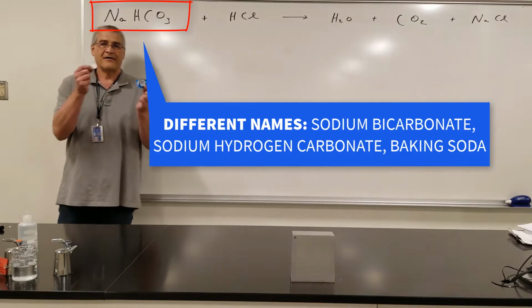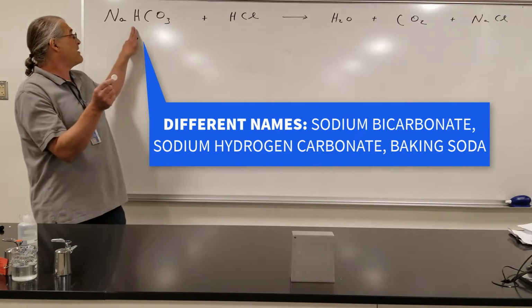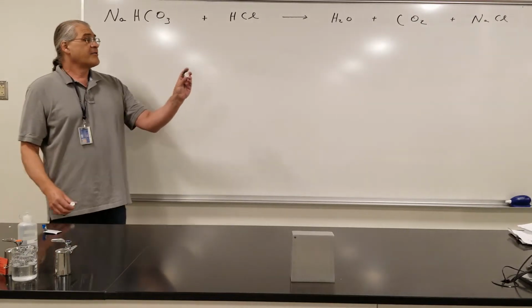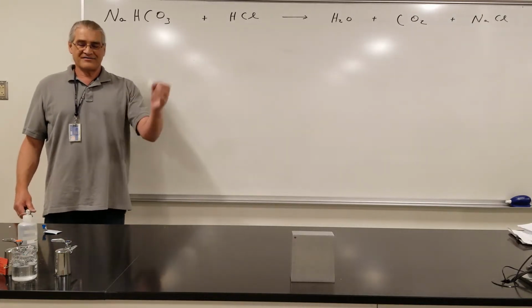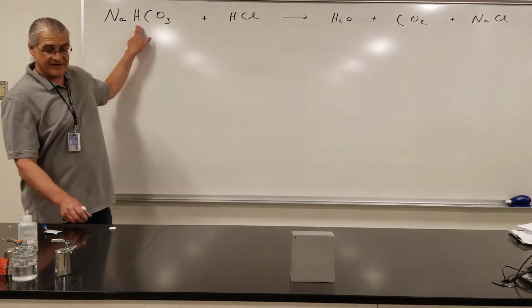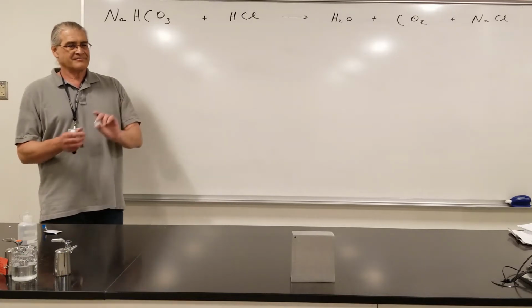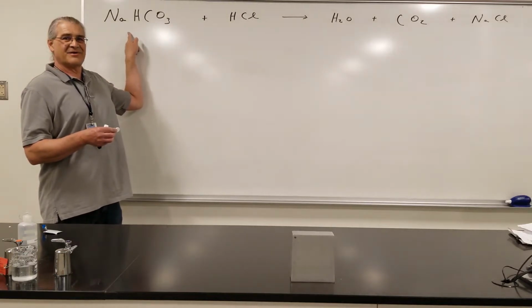Alright guys, our Alka Seltzer tablet. Again, it's a combination of aspirin, baking soda, and citric acid. Citric acid is a dry white powder. So all three chemicals are smashed together here. What we're trying to do today is figure out what percentage of this tablet is the baking soda. So we'll weigh the tablet so we know how much it weighs. Then we just have to figure out how much of that tablet happens to be the sodium hydrogen carbonate.